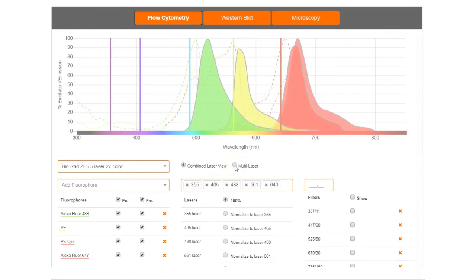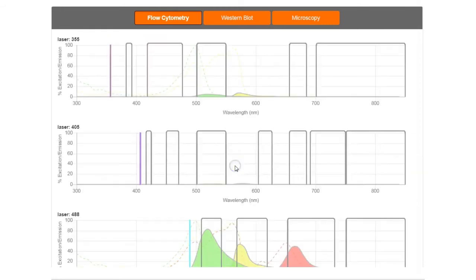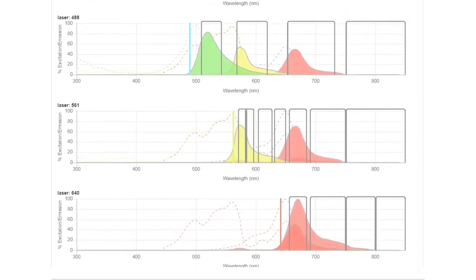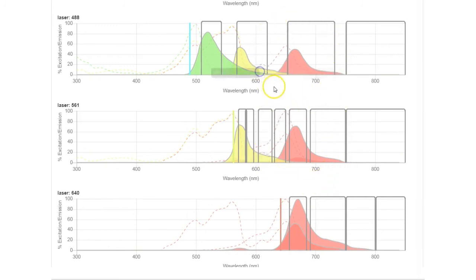Using the multi-laser view, you can break the spectra down by laser, allowing you to quickly and easily check the amount of fluorescence from suboptimal laser excitation, any cross-laser excitation emission, and spillover. Additionally, this feature enables you to compare dyes that have similar emission and excitation spectra but are excited by different lasers.